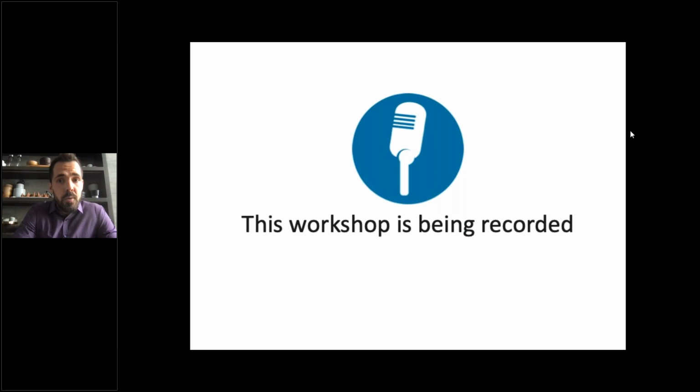I would like to thank you all for taking part in today's webinar called Finding Samples and Data with the Bbmri-Eric Directory and Negotiator. So basically, today you will learn how to find samples from over 600 biobanks across Europe using our Bbmri-Eric directory. And moreover, you will also learn how to send sample requests to multiple biobanks using our Negotiator tool.